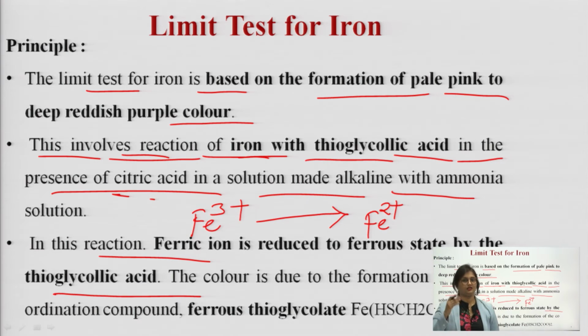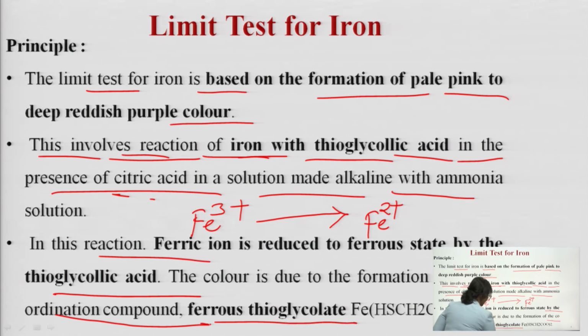This reaction further proceeds, that is, the ferrous ion further reacts with thioglycolic acid to form a coordination compound known as ferrous thioglycolate.